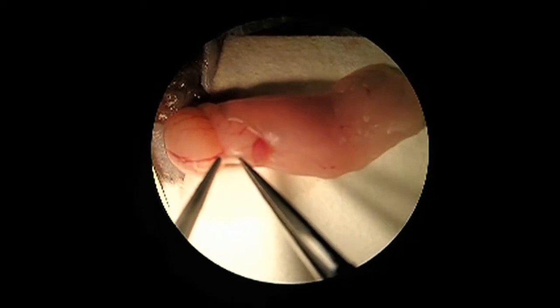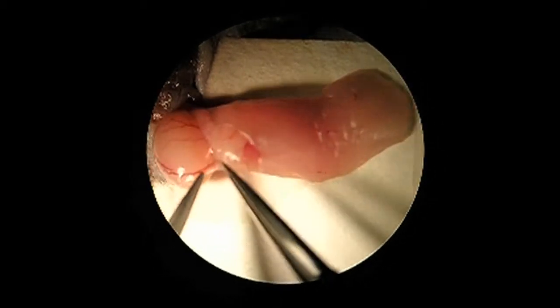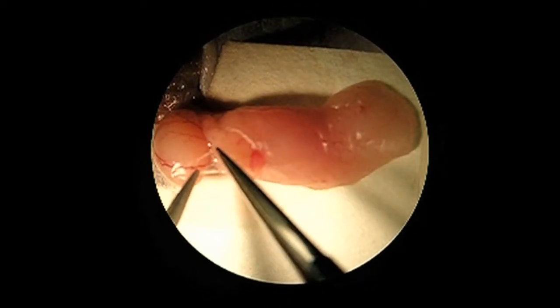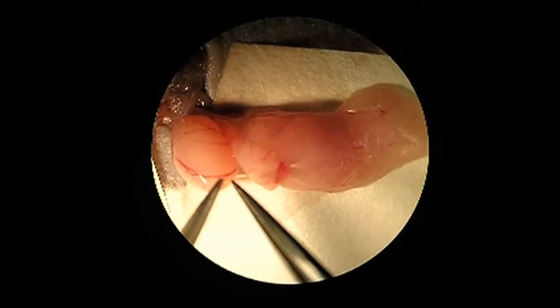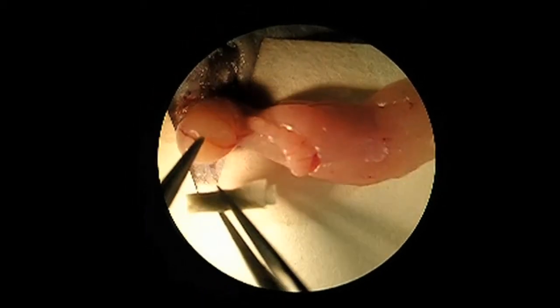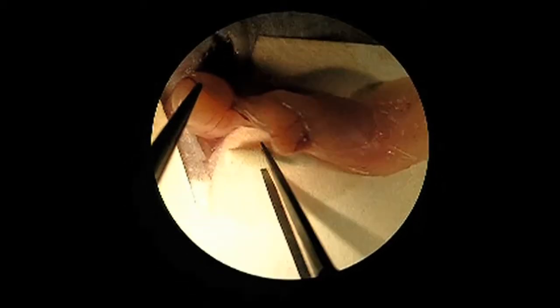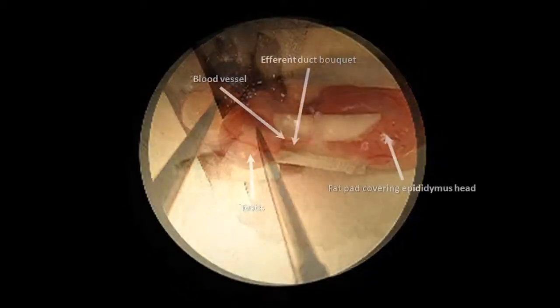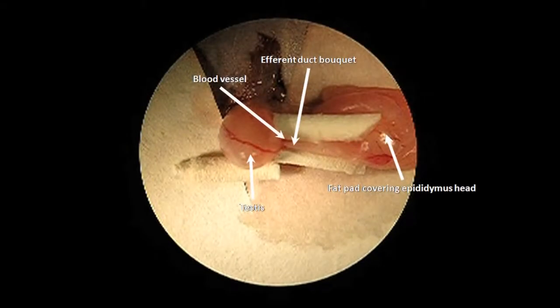Use fine forceps to dissect the membrane connecting the caput epididymis and the apical part of the testis. If necessary, carefully peel away the fat covering the efferent duct bundle in order to visualize it clearly, taking special care to avoid breaking the blood vessel under the efferent duct bundle. Sterile paper sponges can be used to position the testis, efferent duct, and epididymis, and to absorb excess fluid. Here you can see the testis in upright position on the left, and the efferent duct bundle aligned with the injection pipette entering from the right side.